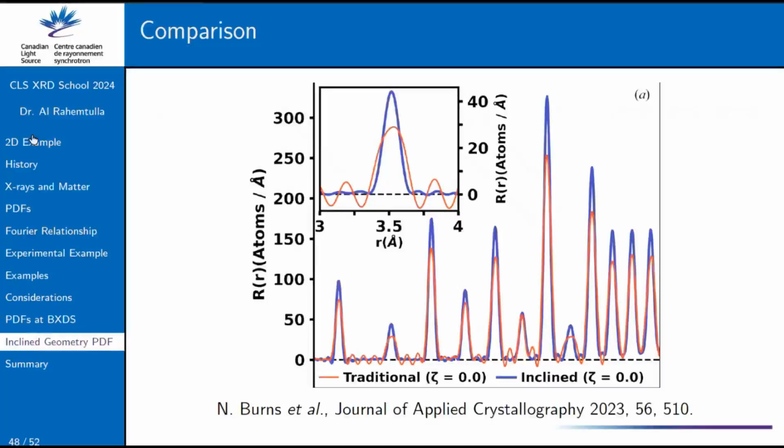It just takes a lot more computational work to get it, which is actually some of the work that we're doing on implementing on the CLS end. That way, you as a user, hopefully when beam time returns, can come with a sample and basically walk out with a PDF like this, just using the computational power and software that we're working on over here.